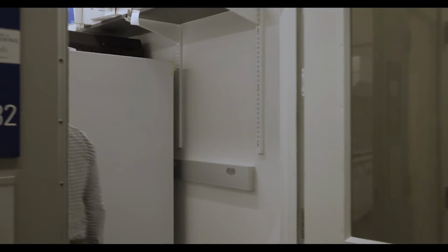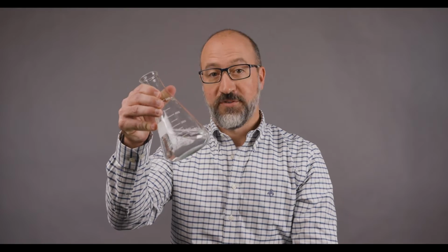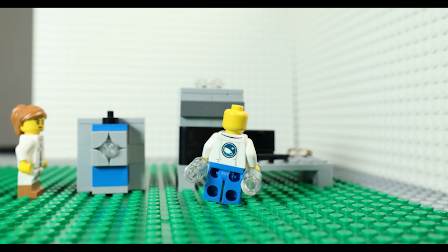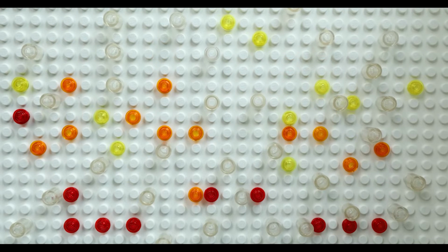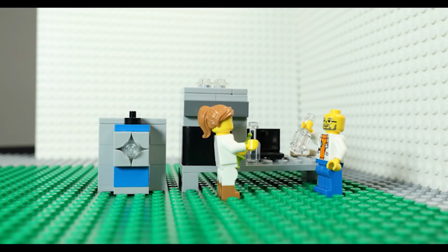We use ultra-high resolution mass spectrometry in my laboratory to provide highly accurate measurements of the weight of each individual PFAS. We start with a water sample. The first step in the analysis is to separate our molecules into groups of similar properties. We use a technology called chromatography to do this. Now we send it to the mass spectrometer.